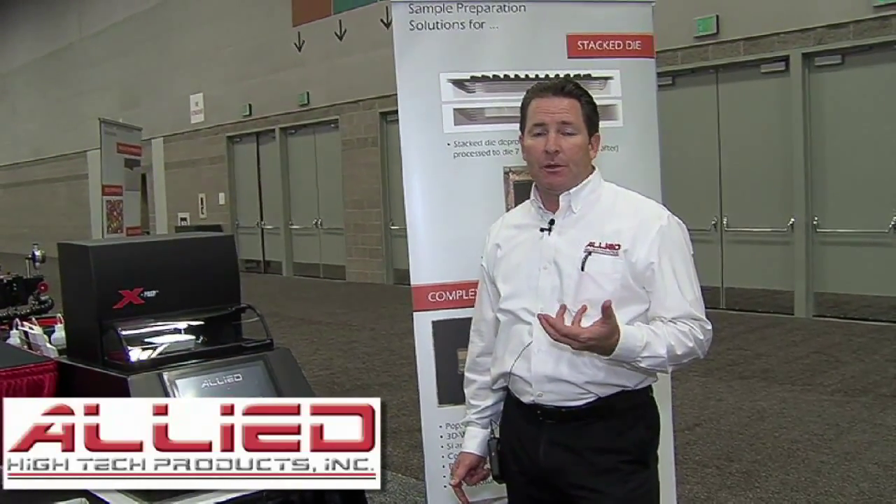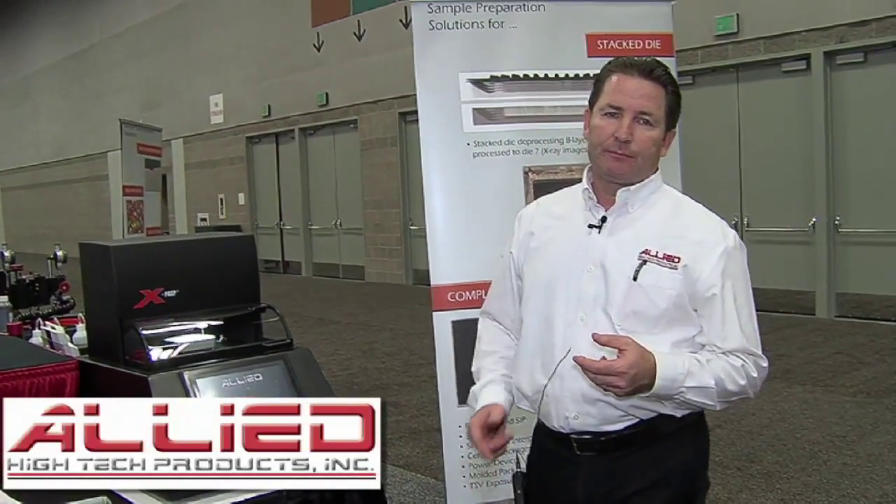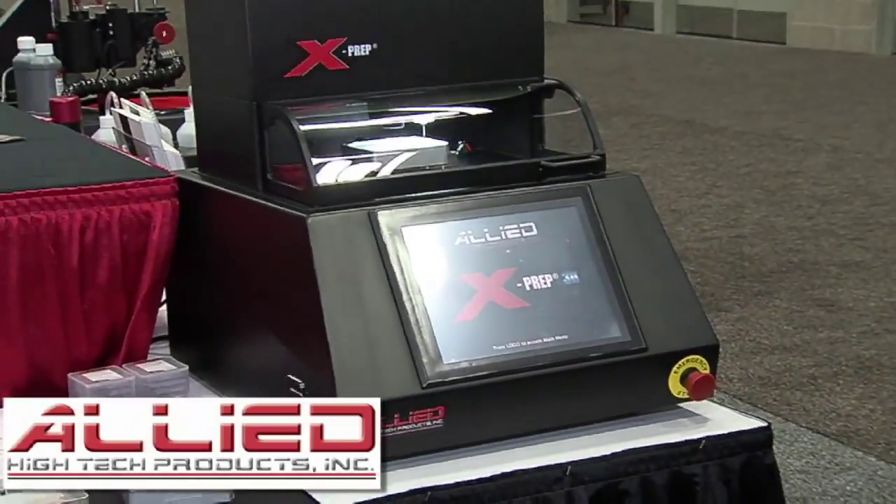What I'd like to share with you are the primary virtues that we believe are the most important when considering a choice. The first is precision.